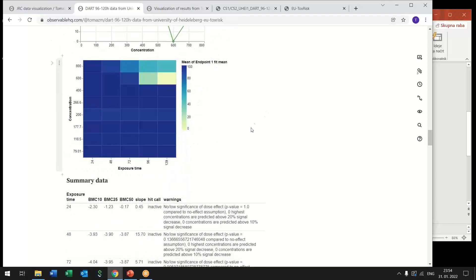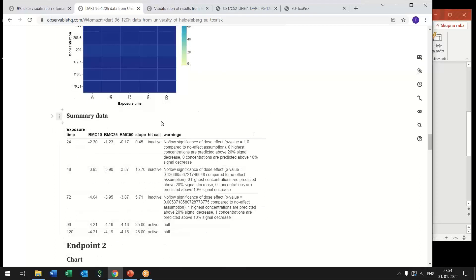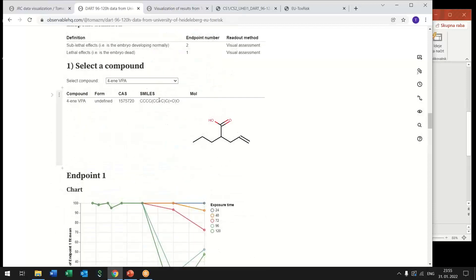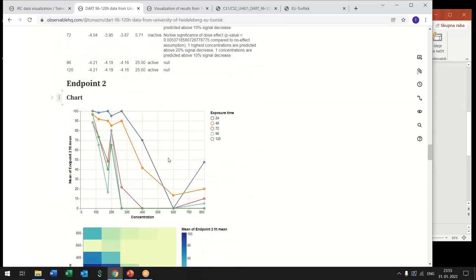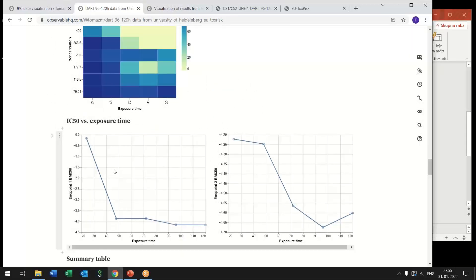And is accessible again from this web service so all these benchmark concentrations are again updated immediately when we change our selection of compound here and the same is repeated for the second endpoint and here we also have similarly as in the previous case IC50 versus exposure time the same dependence.